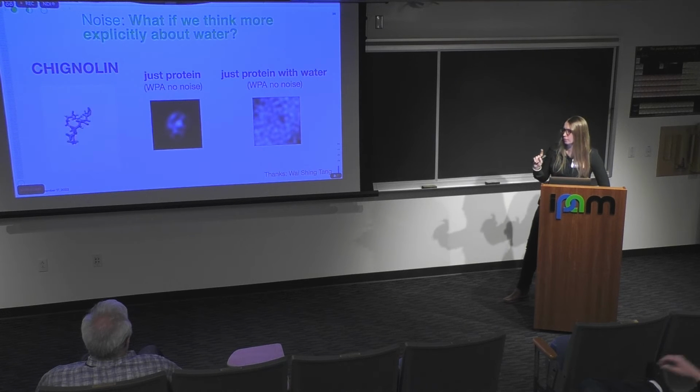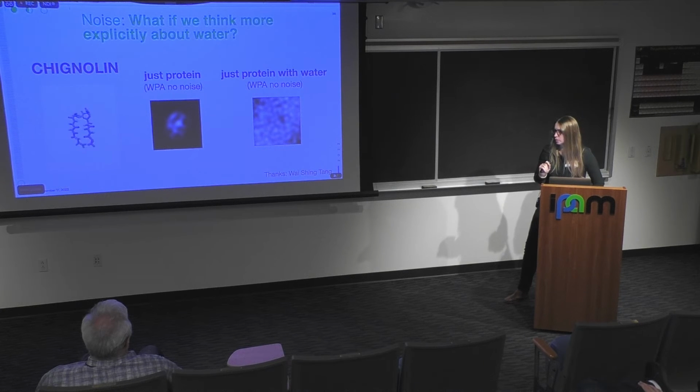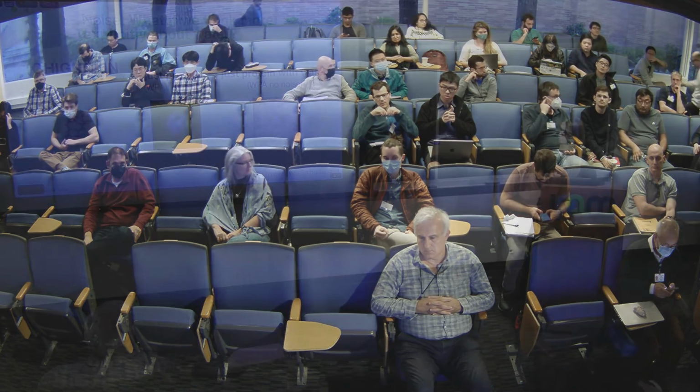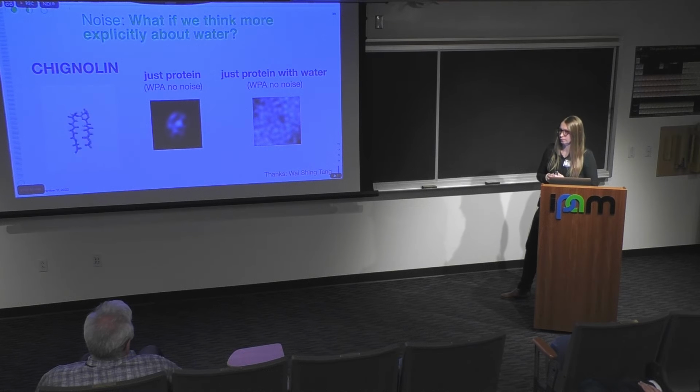It's not because of the movement of the protein. So then it's because of the water molecules that are surrounding it? Basically? Yes. So here we have a box of water molecules on all sides of this protein. And that just hides it completely? Yeah.